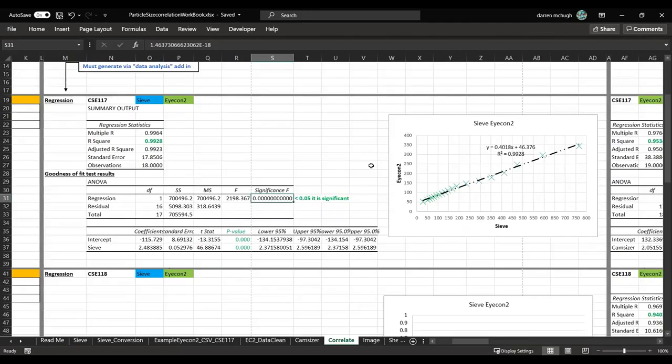There is a relationship between them. And then you look at the p-value as well. The p-value is the probability relationship. If this is also below 0.05, you're essentially saying that the probability that this relationship is accurate is 95%. Now, 95% sounds good, but you always have to have in the back of your mind that there is also a 5% chance that this is coincidental. That's why you do repeat studies and expand your study.